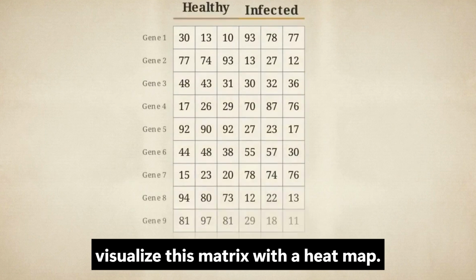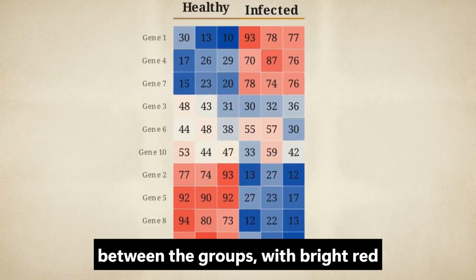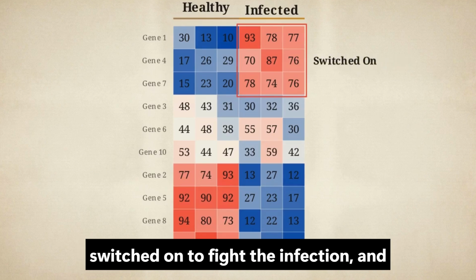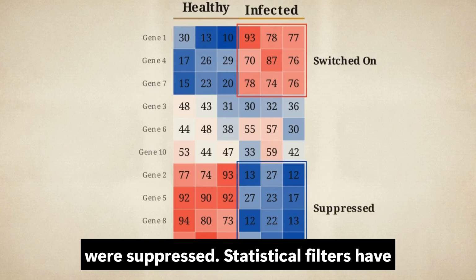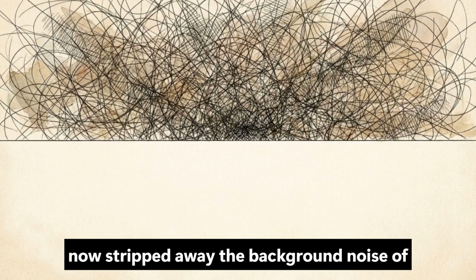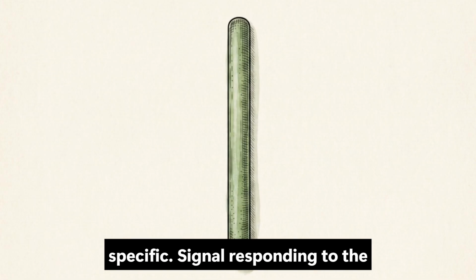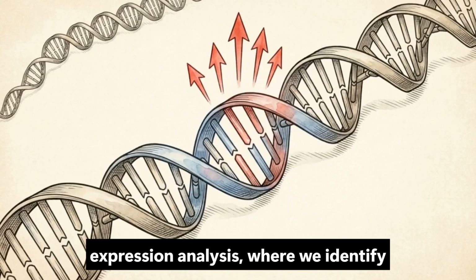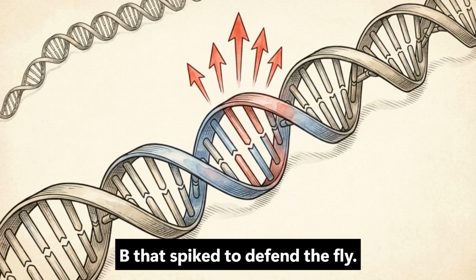We visualize this matrix with a heat map. This grid shows the exact contrast between the groups, with bright red regions highlighting the genes that were switched on to fight the infection, and deep blue regions showing the genes that were suppressed. Statistical filters have now stripped away the background noise of the entire genome, isolating the specific genetic signal responding to the bacteria. This leads to differential expression analysis, where we identify the specific immunity genes, such as NF-kappa B, that spiked to defend the fly.